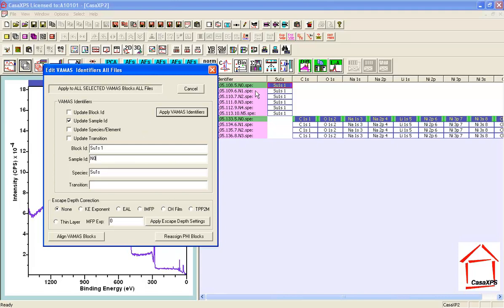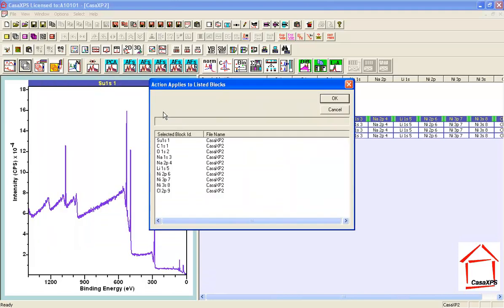I have the VAMAS blocks selected that I wish to assign the same sample ID. And when I press Apply, I get a confirmation dialog window just to make sure that I'm going to make the adjustment to the correct VAMAS blocks.